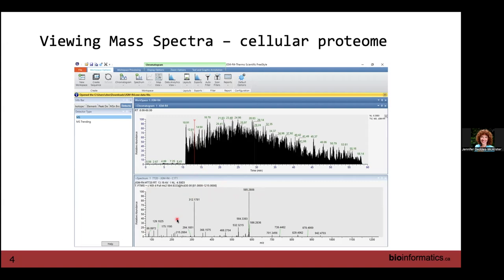This is a DDA approach, so the top N peptides at any given millisecond — the most abundant ions on the y-axis — are what get measured. Features we look for in a total proteome include a full, rich chromatogram with good coverage across the entire run, no gaps indicating no air or water bubbles, and intensity values around 10^9 to 10^10. Just from quickly looking at this chromatogram you can gain all kinds of information about your sample.